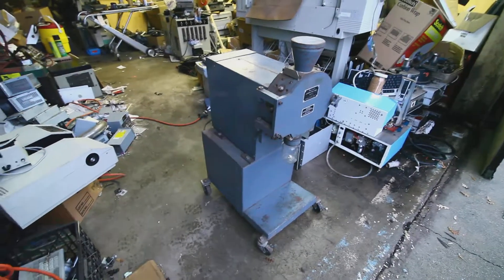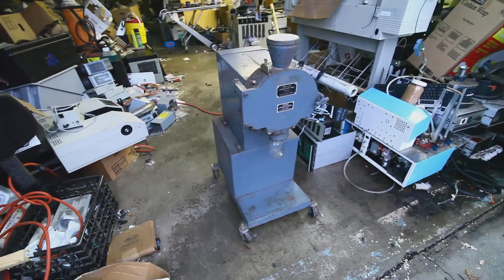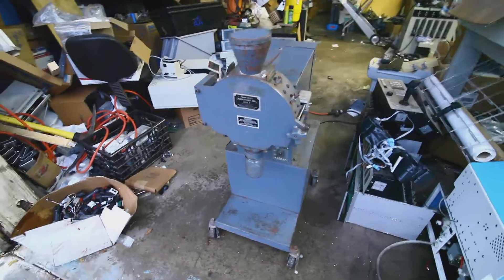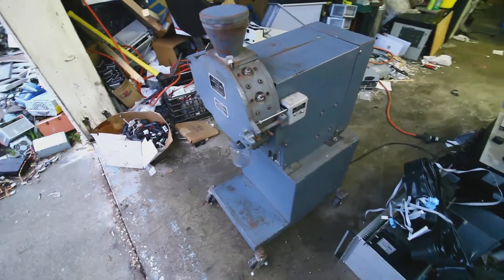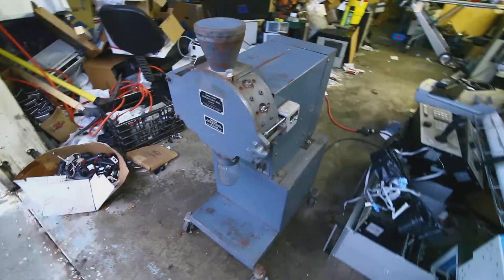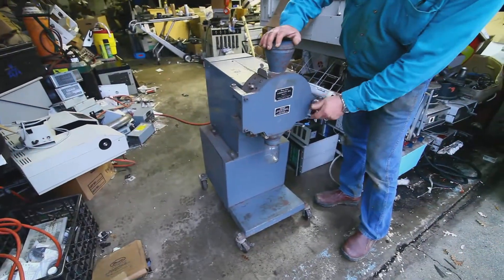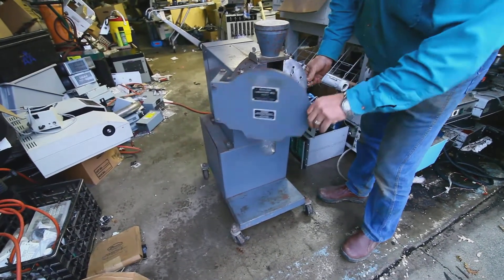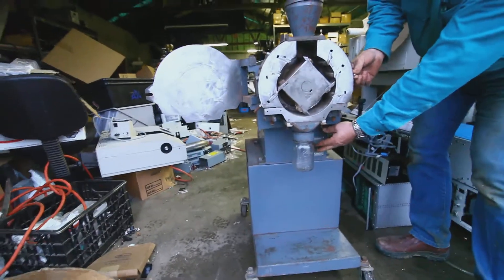Here's a stationary shot of the Thomas Wiley Laboratory Mill Model 4. I'm going to open the front door of the mill, defeat the safety switch, and turn it on just to show you what happens.